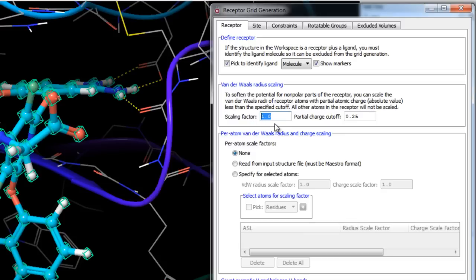By scaling van der Waals radii for non-polar receptor atoms, you can adjust the scaling factor — by default set to the recommended value of 1 for ordinary Glide docking. If working with a particularly tight binding site, you could try reducing scaling factors to allow non-native ligands to dock and score better. Keep in mind that changing scaling factors changes final docking scores, so results from runs with different scalings cannot be compared directly. There is also a partial charge cutoff for scaling, to ensure only non-polar atoms are scaled.